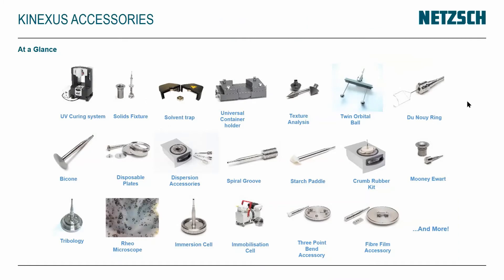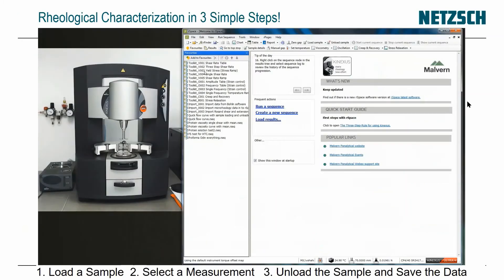These are some of the Conexus accessories. There's a wide range of them, including a microscope at the bottom of the screen so you can see a sample as it's being sheared. I'm now going to run a sample, showing loading, selecting the measurement, unloading, and saving the data.